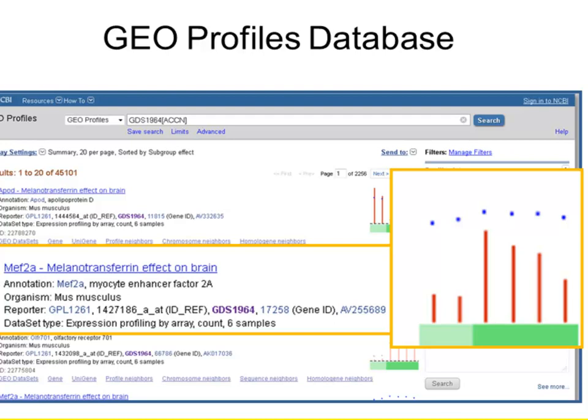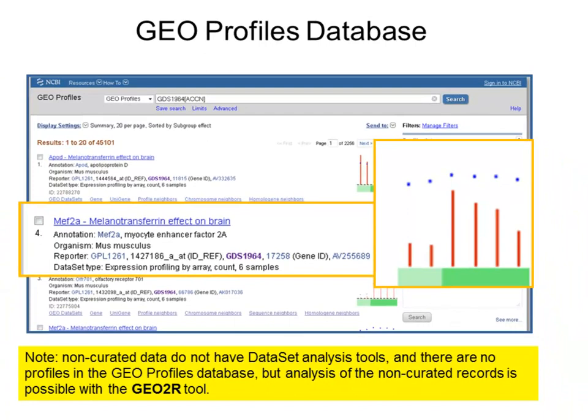Remember that only curated datasets benefit from these visualizations of the data. Given the immense amount of data submitted to GEO, it is not possible to immediately curate all studies. So the GEO group developed a tool called GEO2R that allows you to perform sample comparison on your own for non-curated datasets. The statistics behind GEO2R analysis are not identical to that in the curated records, but you can easily run GEO2R on a curated study for comparison.